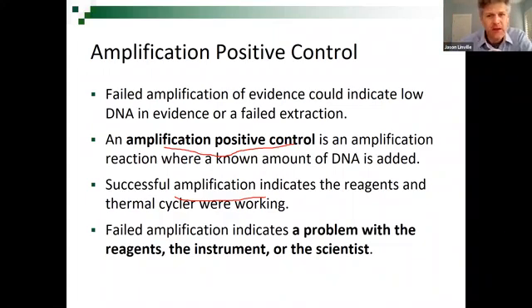It's a good question, because sometimes you think they probably just take a person and extract their DNA and sell that. There are some known standards that are maybe from different donors or combinations, but most of the positive controls that come with kits and that forensic labs use are a cell line that always has the same profile.